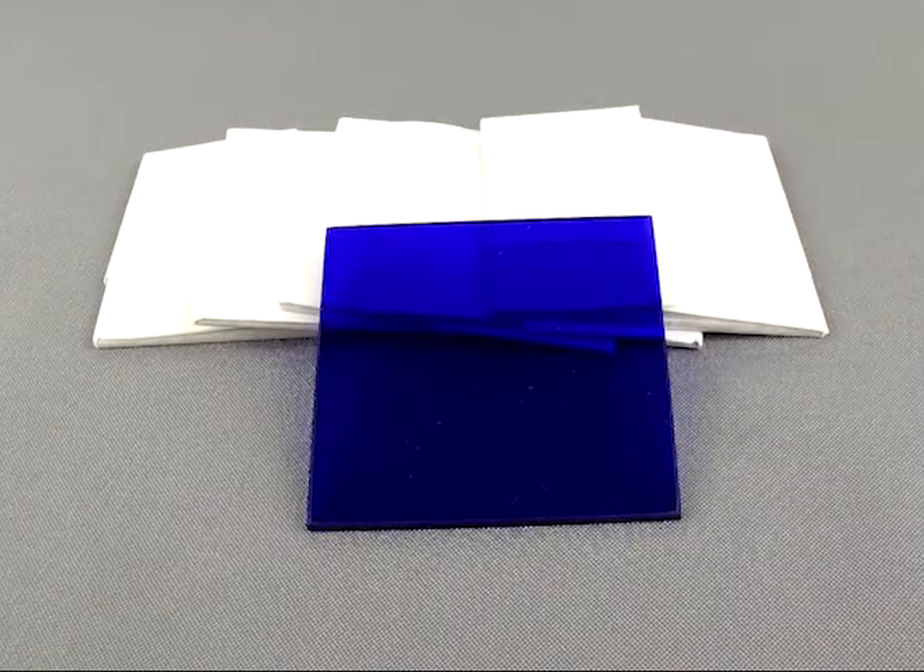The high quality cobalt glass plates come as a pack of six. Each one is three inches by three inches square.